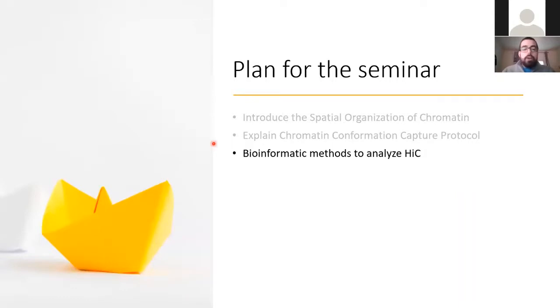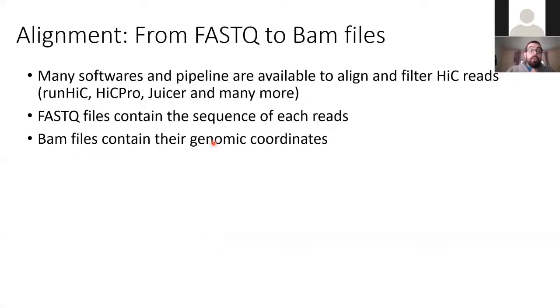So now, how do we analyze? I know I talked a lot about the resolution of the Hi-C heat maps. Here I'm going to show you how to read those and how to make those. But first, we need to align the FASTQ files.